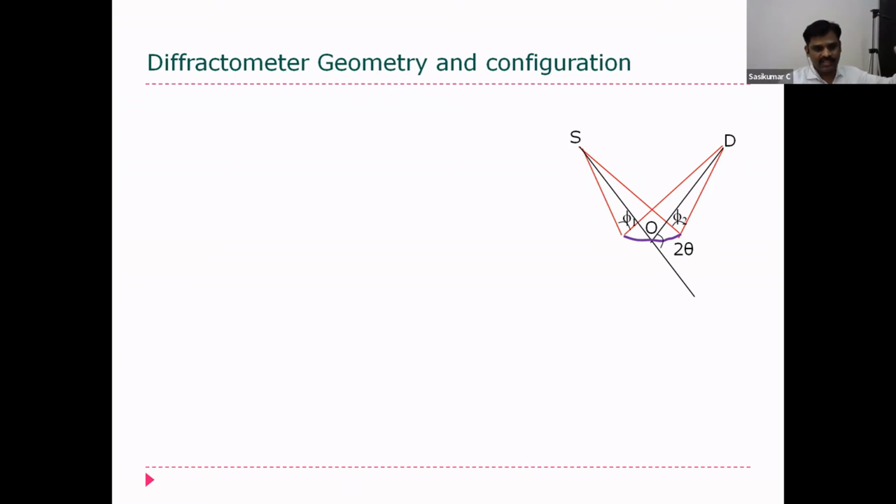The X-ray incident on the plane is going to diffract, but the plane is imaginary. Where is the plane? You do not know. From where it is reflected, you do not know. So how are you going to calculate the 2 theta? In that case, we know where the beam is transmitted, and we know the diffracted beam. From this, the 2 theta will be worked out. That is how the movement of the detector and source is done in the design.